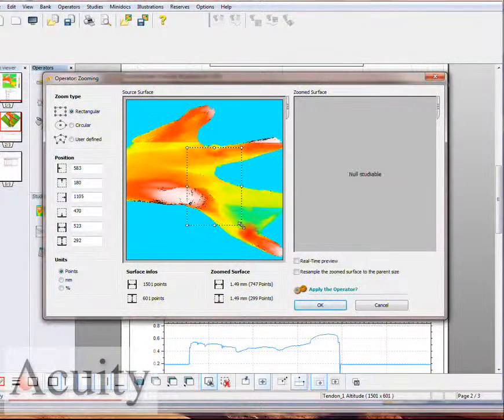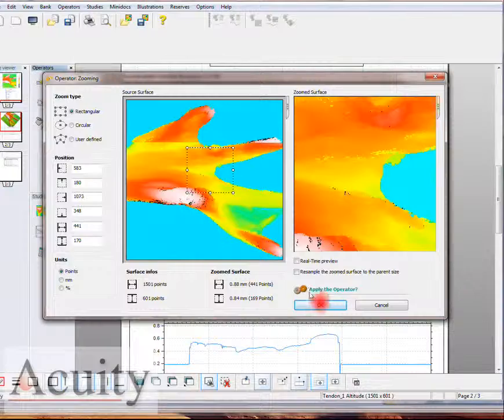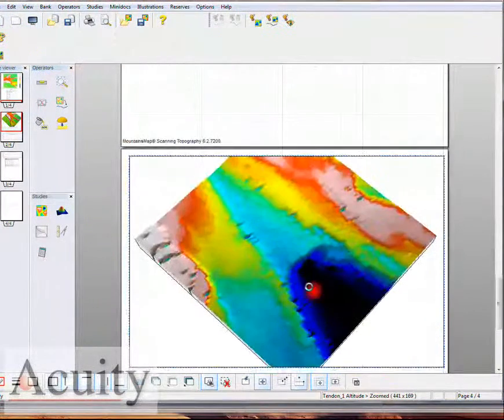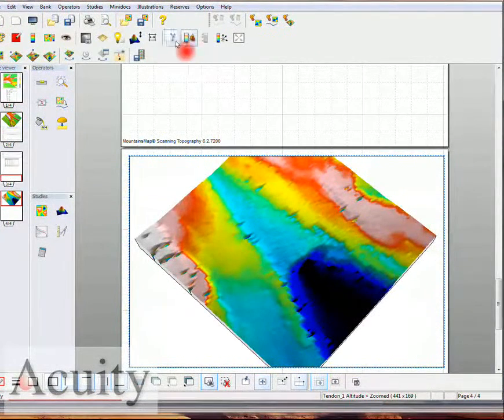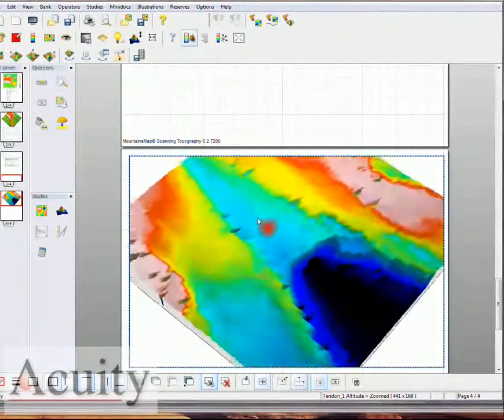Here you can see the level of detail that we're being able to measure with a white light confocal probe.